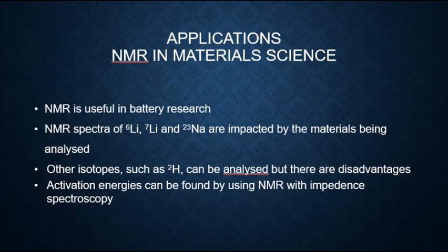Using solid-state NMR to analyze battery materials is a very convenient way to obtain information. NMR is used to analyze battery materials because NMR spectra of lithium-6, lithium-7, and sodium-23 are impacted by the materials being analyzed, because lithium and sodium ions participate in the redox reactions in batteries.